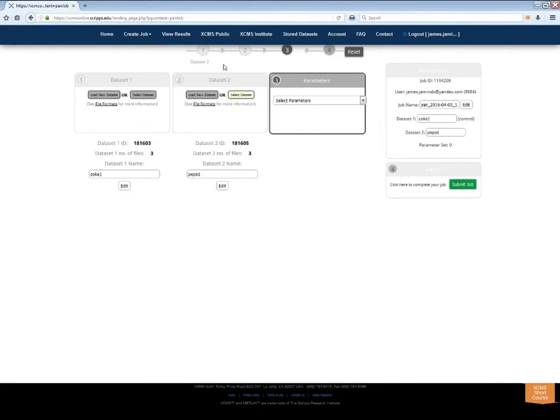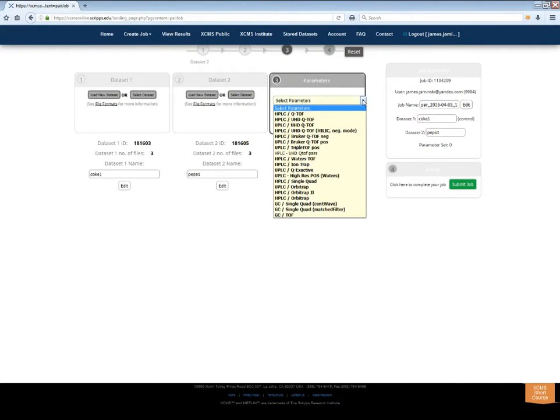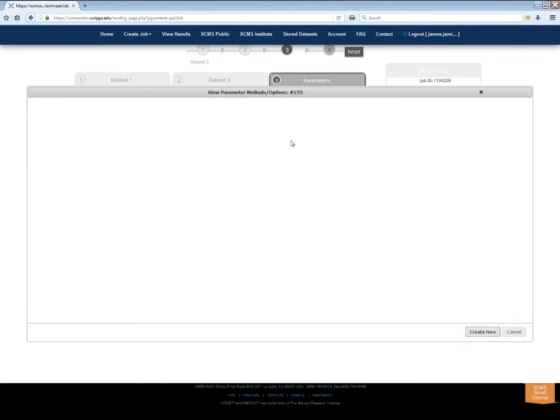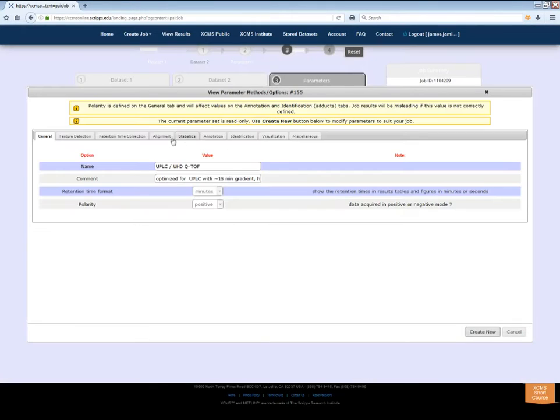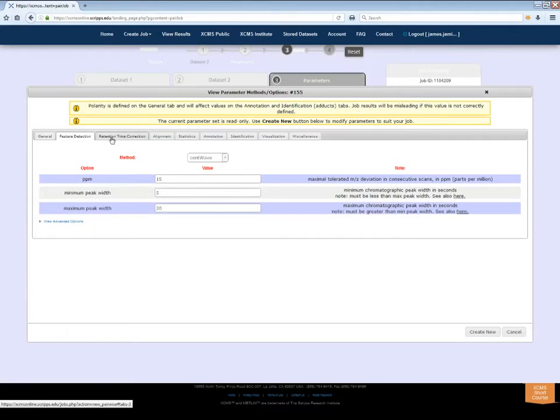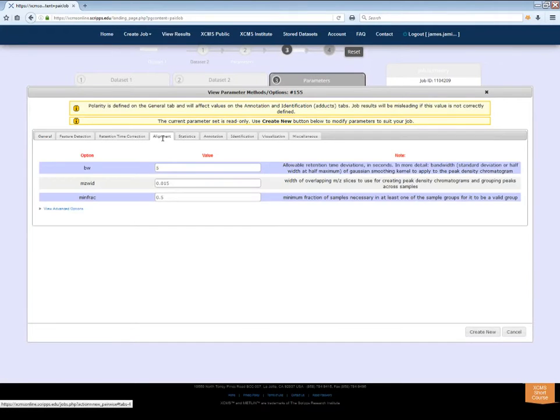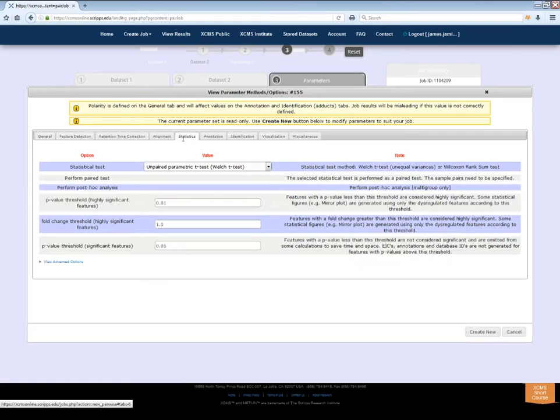Once both datasets are uploaded, move to Step 3 and select your parameters. XCMS Online provides many presets to choose from. Be sure to pick parameters that match your environment. The default settings work well for most jobs, but you should always check your parts per million and polarity. Click the View Edit button to review and change settings as needed.